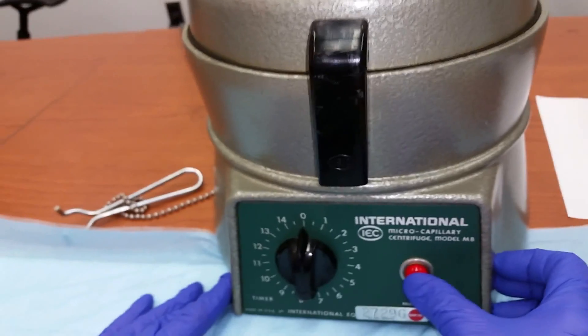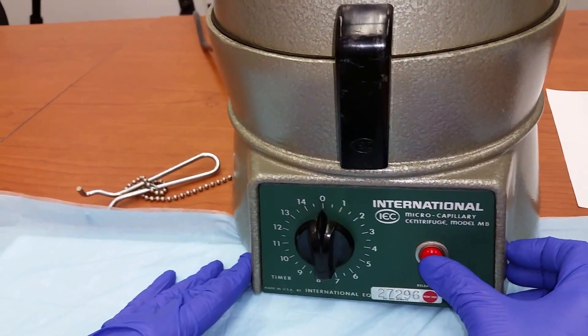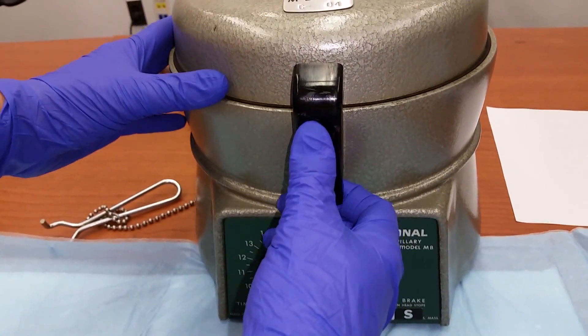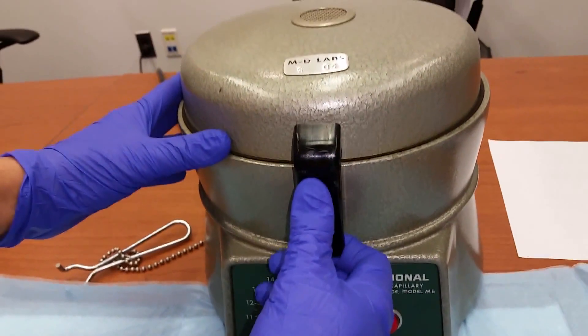You can use the brake to slow down the centrifuge when it's finished spinning. Unlock and open the centrifuge top when the centrifuge has stopped spinning.